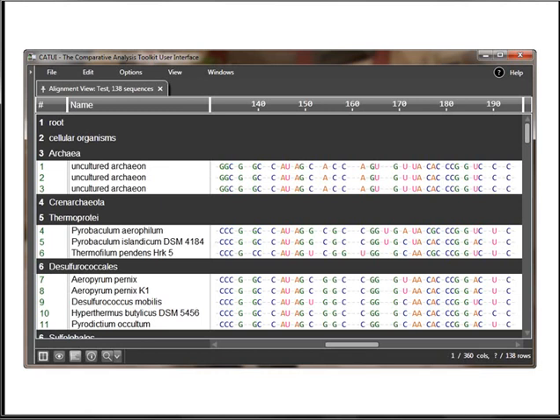The Alignment Viewer component in version 3.0 of the CATUI is one of the most advanced RNA sequence alignment viewers available. Currently, the Alignment Viewer is capable of scaling to support the visualization of RNA sequence alignments with more than 100,000 sequences on a laptop computer, a feature no other sequence alignment viewer or editor currently available can claim.